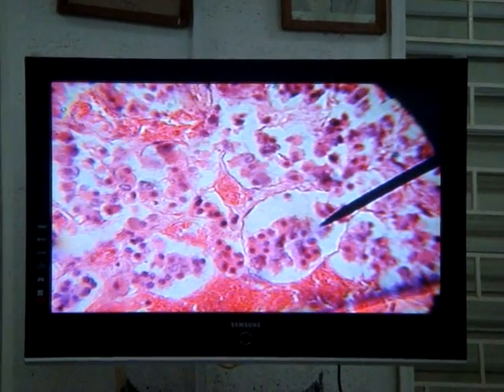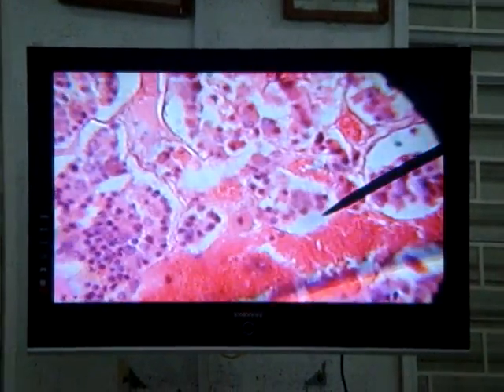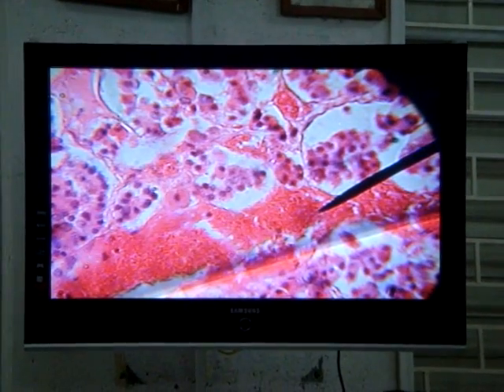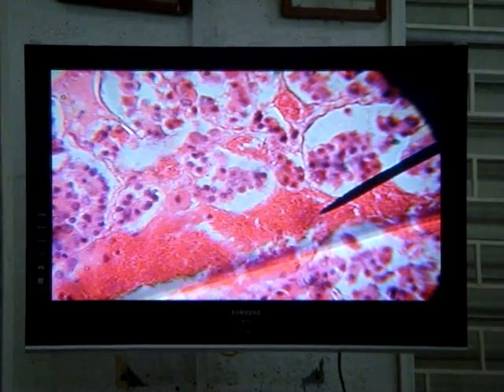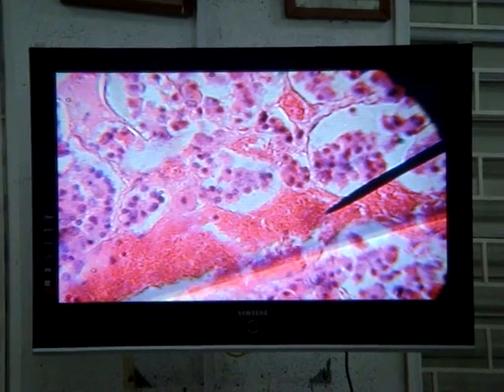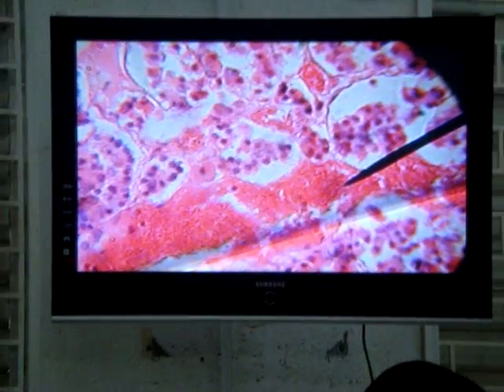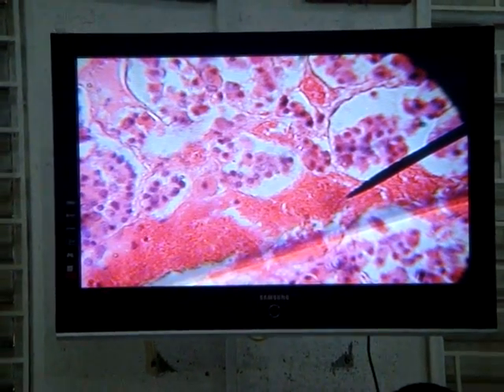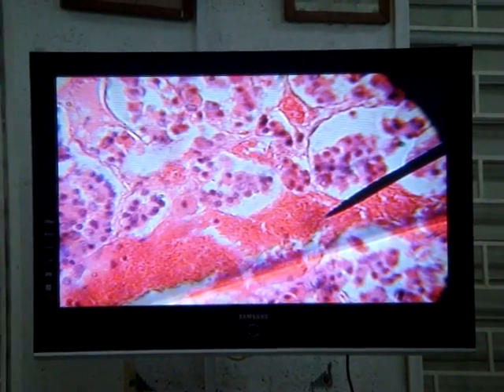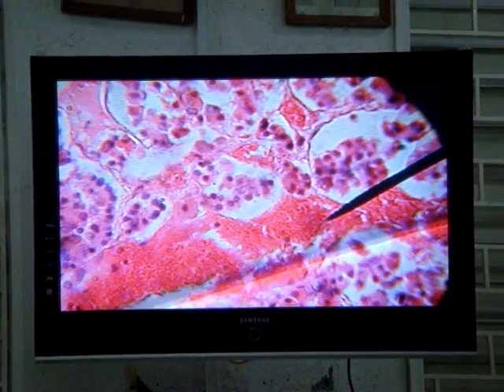And these cords are surrounded by little strands of connective tissue. And look, juxtaposed right beside the cord, a lot of capillaries there with RBCs. So these cords are highly vascular. So we have said some good things. We have talked about the fact that the pituitary is divided into an anterior and a posterior lobe, with sometimes an intermediate lobe between the two. We've also observed that it has an investment of dura mater as the capsule. And now we're talking about the arrangement of the cells of the anterior lobe being organized into clusters.